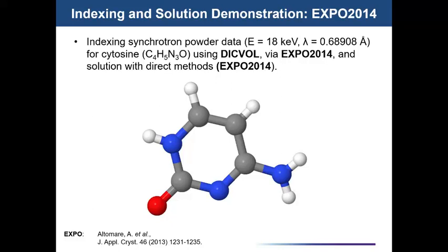So having chemical information is really important because it basically found the right basic structure, but an atom was swapped. And if you didn't know that from other methods or chemical intuition, you wouldn't know. But it's providing a basic building block now to do a Rietveld refinement. The other thing here is you don't have the hydrogen positions.